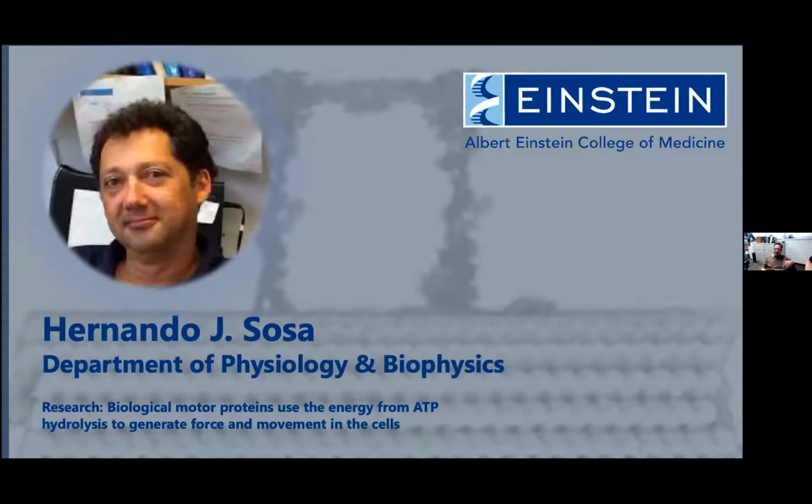I've been switching techniques. When I was in a pathology department, I moved to single molecule fluorescence techniques to get structural information. But now, with the revolution in resolution, a lot of the questions we had on molecular structures can be addressed directly using cryo-EM. It's a very exciting time to be doing cryo-EM.